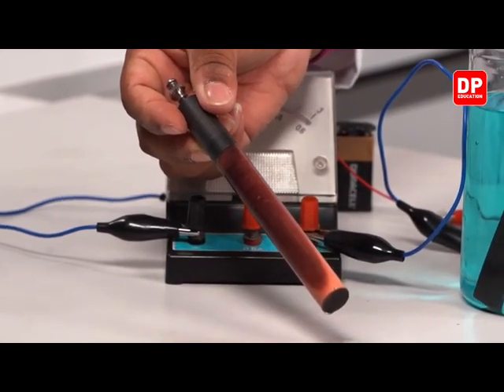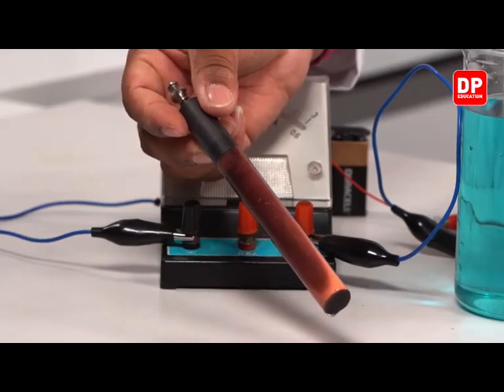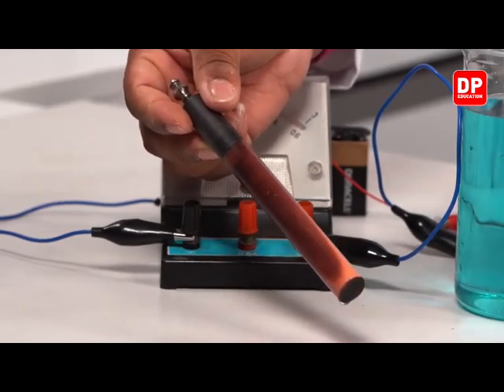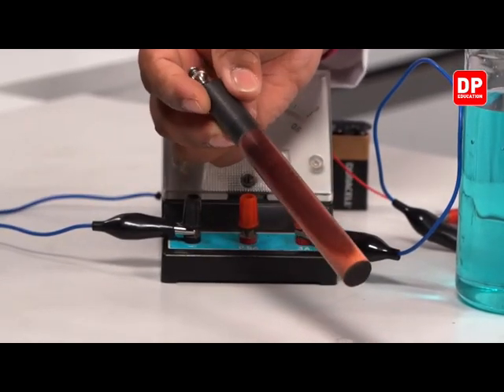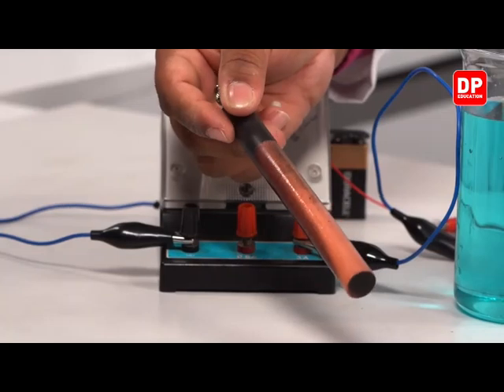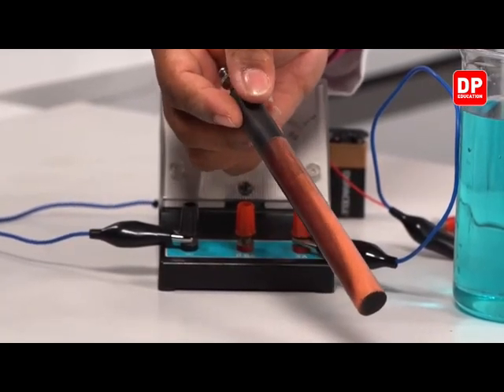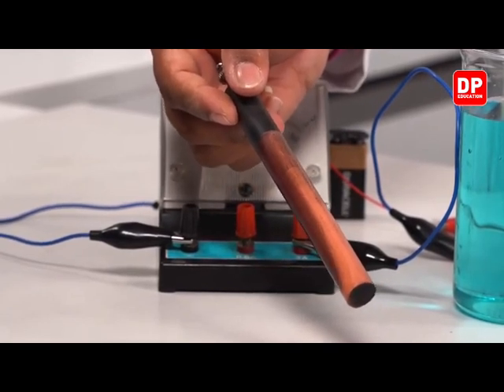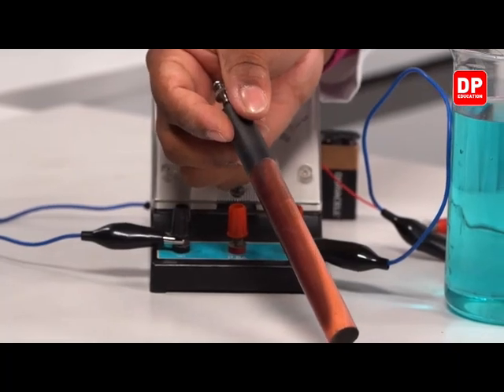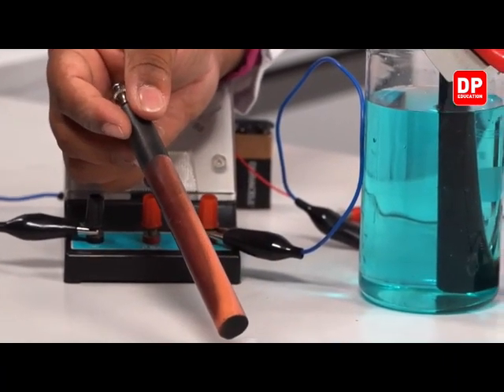Here once again you can see this is the positive terminal, which is in the red color. This is still within the solution. I have taken out the negative terminal. There is a clear deposition of copper on the negative terminal. This is copper, my dear children. You can see it very clearly, right? And you can even identify this color. This brownish colored substance is copper.